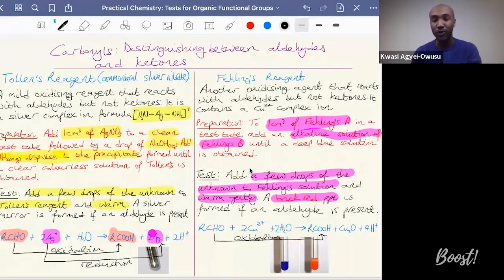And you've got your copper 2+ being reduced to copper 1 in your Cu2O. So we go from 2+ there, that is, of course, a reduction. And we can zoom into the two test tubes for before and after.